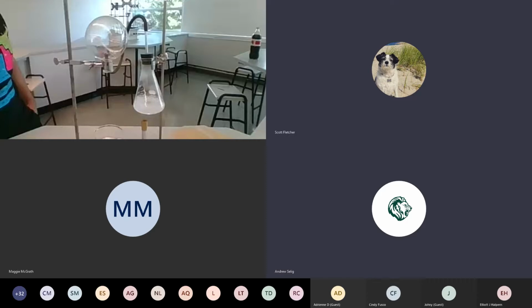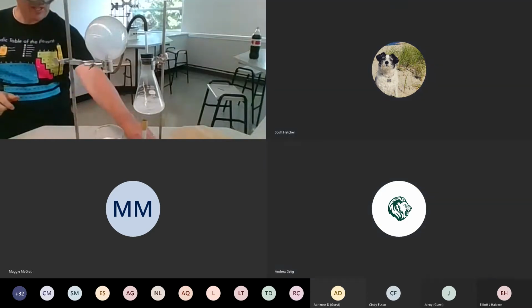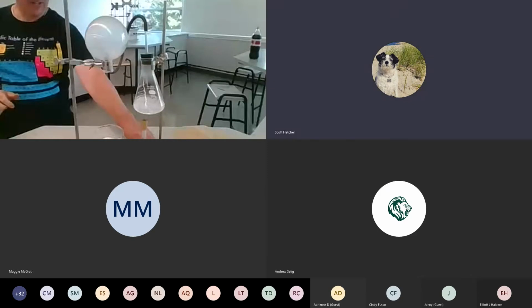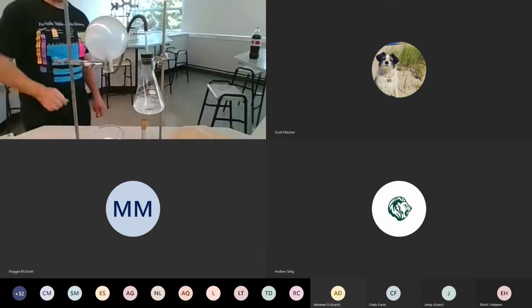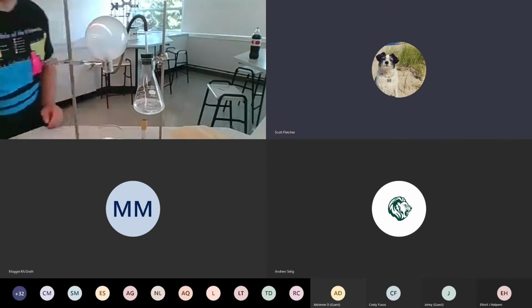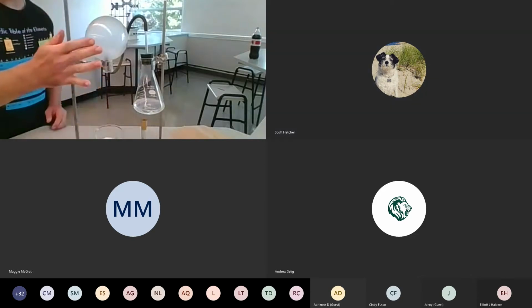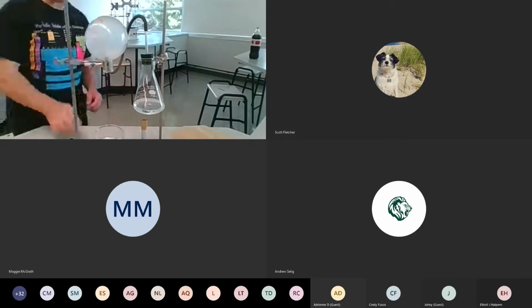Yes. Now, you might think that it's boiling, but that's actually just all the ammonia that's coming out of solution. And I actually turned off the Bunsen burner. And it's filling this flask that's over here. A little bit of water vapor made its way in also.